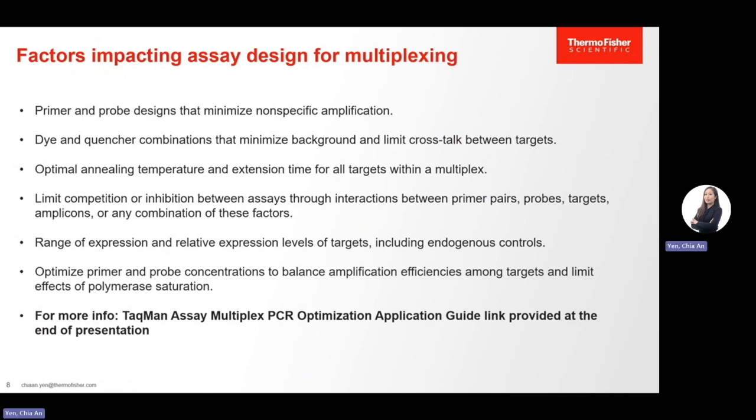For more detailed information regarding multiplexing and assay design, we do have our TaqMan assay multiplex PCR optimization guideline online that you can sign up to request a link to with this webinar and check out on your own, as I don't have the time to cover all the information in there today.